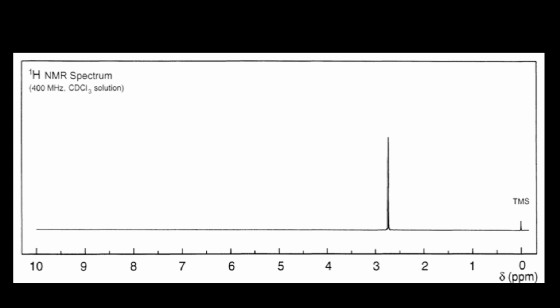So here you are seeing only one peak. As you may see here, only one peak is present. It means only one kind of hydrogen is present in your chemical formula, and your chemical formula was C6H8O2, so 8 hydrogens are present here. This is the integration value. Also it means that in this peak area 8 hydrogens are present.